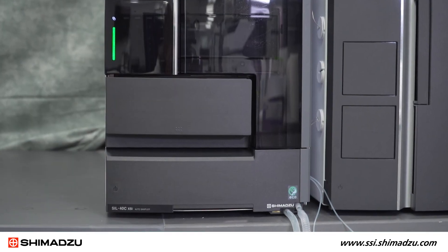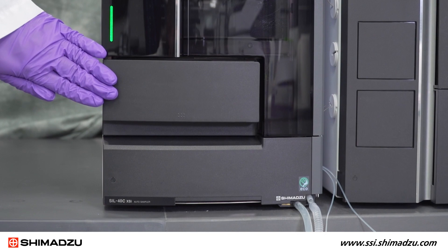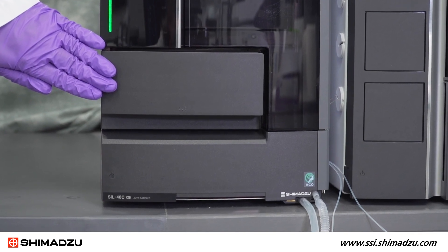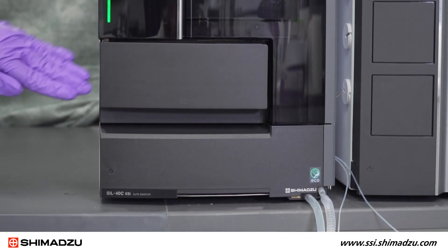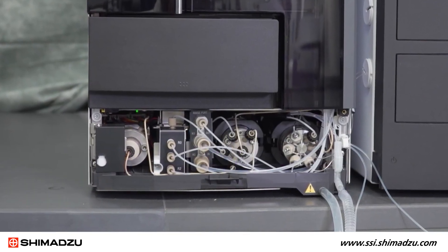Next we have our SIL40C XSI inert auto sampler. Non-metal materials are used for all surfaces that come in direct contact with the sample. If we open the auto sampler, we can see some of the non-metal parts or components.